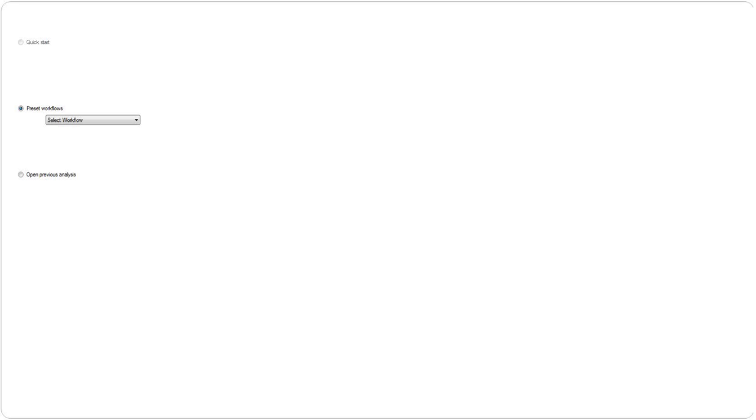This is a Pinnacle how-to video, and this particular video is focused on file grouping. This video will provide a step-by-step set of instructions on how to group raw files in a particular workbook.